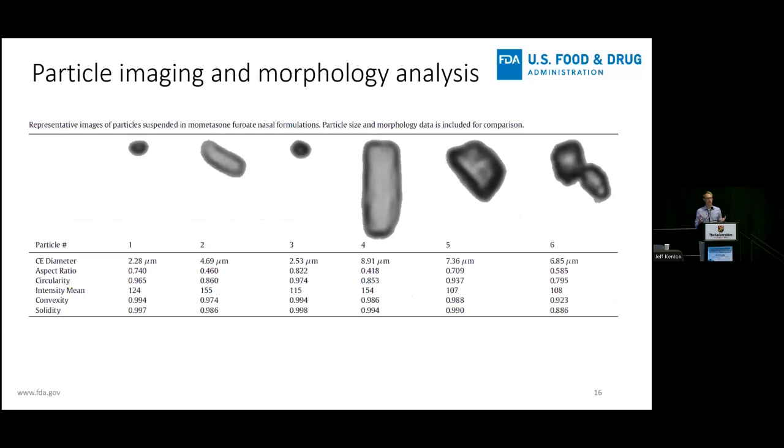So when you run your sample, you would just pick out a few particles, randomly selected, just to look at. As you can see, part of this formulation has small round dark particles, others that are transparent and elongated, and then you have larger square type particles, and the particle you see on the far right-hand side is actually 2 particles touching one another. So we want to try to avoid this as much as possible. Even though you can push these out with filters, it's best to try to avoid them to get the most accurate depiction of your sample.